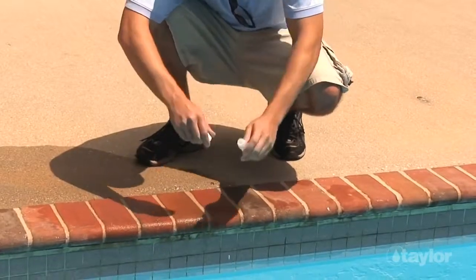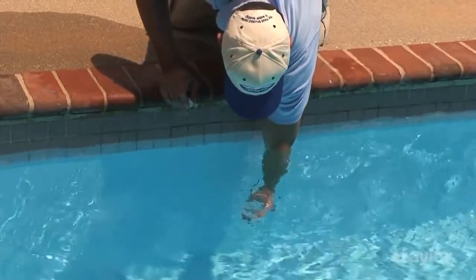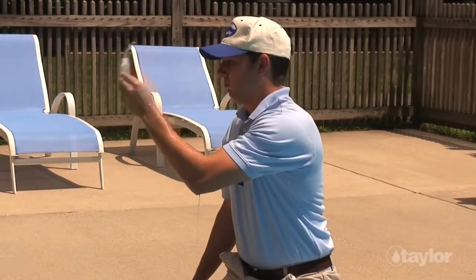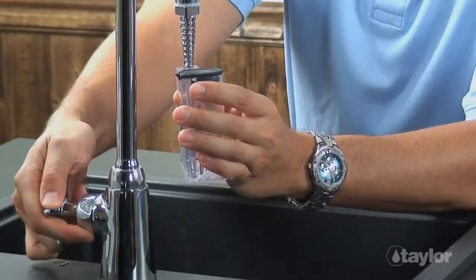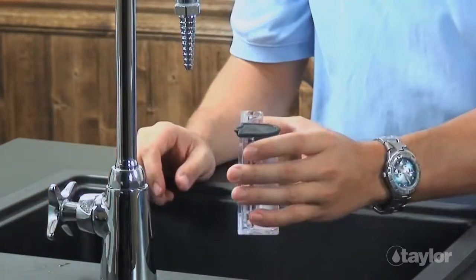Begin the test. When instructed to fill the number 9191 Cyanuric Acid Dispensing Bottle, the number 9198 Graduated Sample Tube, or any other test tube or test cell in your Taylor kit, follow the same procedure. To avoid cross contamination, remember to rinse all sample containers and caps between tests. Do not dispose of treated sample water in the pool or spa.